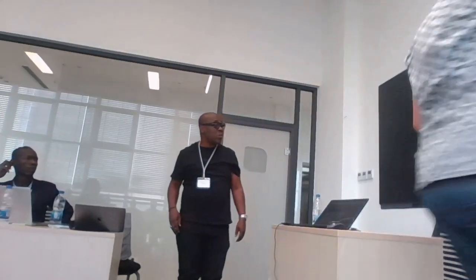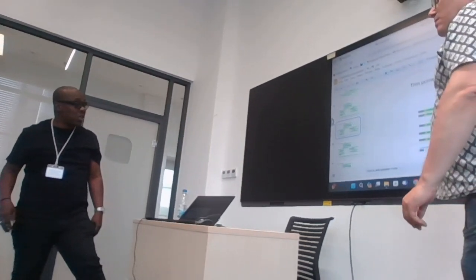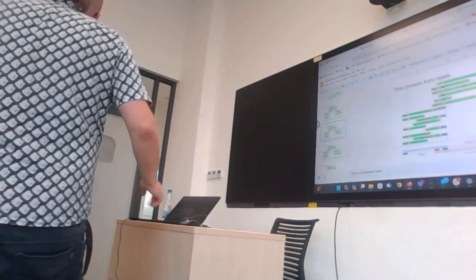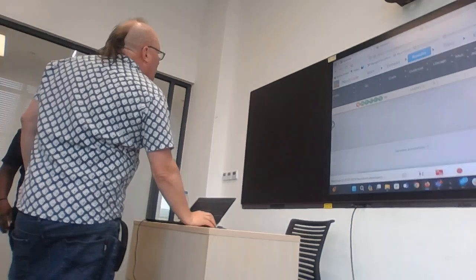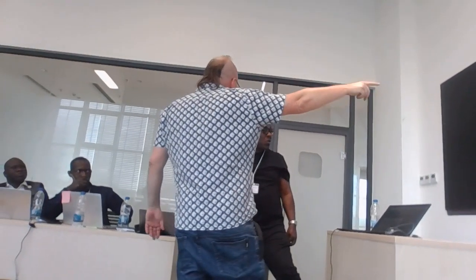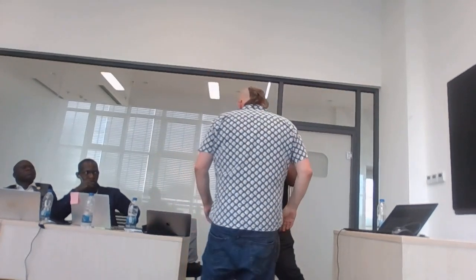Yeah. The mixed sites. Why is it bad to have mixed sites? Because it is a sign of possible contamination. Remember, if you've got a mixture in one position, let me just go back to the slide. We should not be seeing this, right? A mixture of two different variants in the same position. So that's why mixed sites is a warning. None of these things are absolute, with quality control you have to always apply your mind. But if you're seeing lots of mixed sites, it's an error.